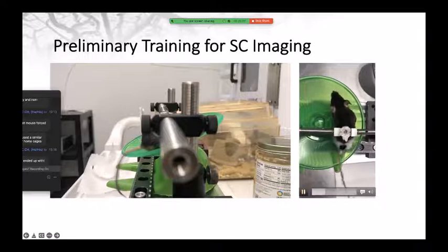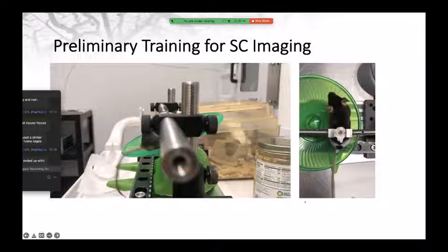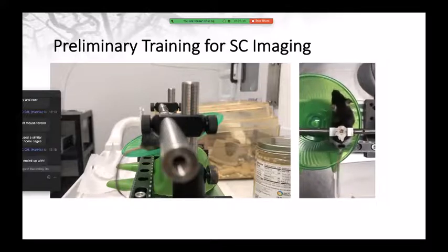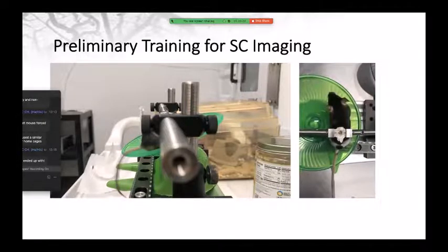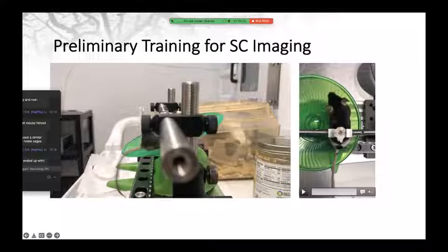And after training, the mice are able to run, this is a good example. One of the good examples where a mouse is able to run voluntarily on the circular treadmill. So in a sense, we kind of had to not really start over, but start over the kinematics, the DeepLabCut kinematics section of it. So I had to acquire more training data in order to train a new network, in order to correlate that to the spinal cord imaging.